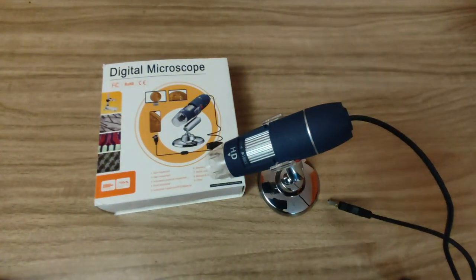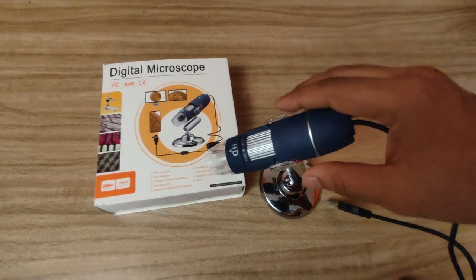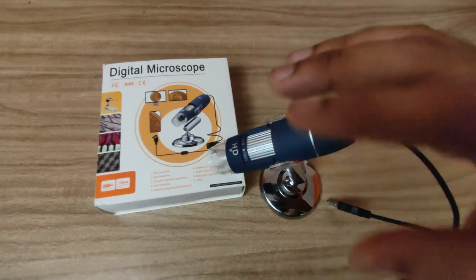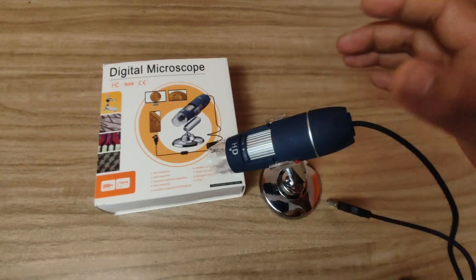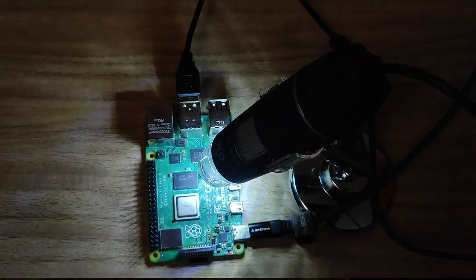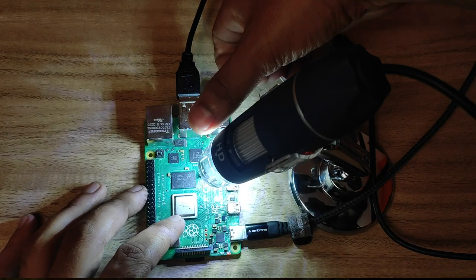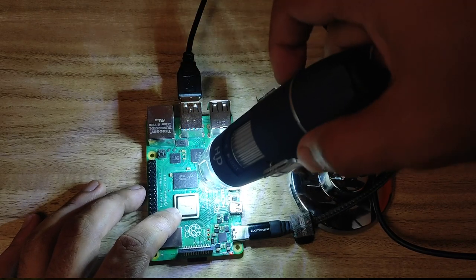You can simply connect the microscope with the stand and it's going to work. Any digital microscope should work with Raspberry Pi because these microscopes are essentially webcams — they work similarly to how a webcam works. You just need to plug them into the Raspberry Pi and it should work; you don't need to install any drivers. I've connected the microscope to the Raspberry Pi using the USB 3.0 port because the LED is quite powerful and needs a good power supply. I'm using a 3-ampere adapter.